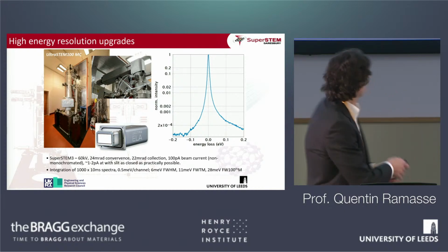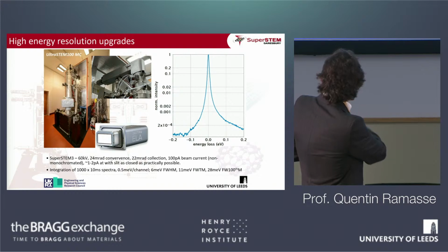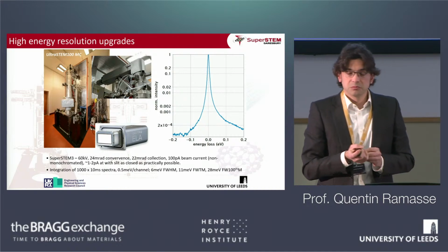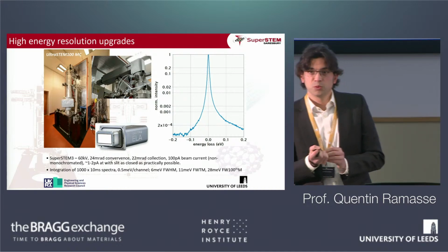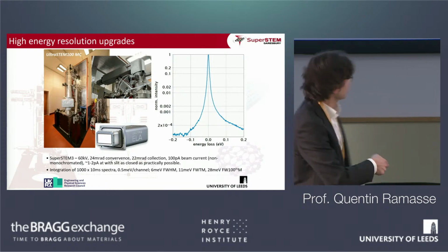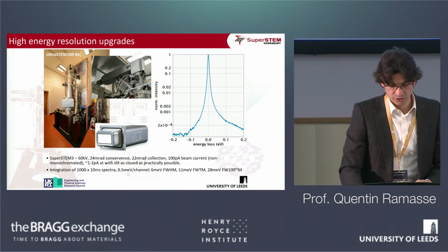So this is what was added to our machine not so very long ago. Just to give you an impression of the size of the microscope, this is about 2.5 meters tall, maybe 3 meters tall, so big, but certainly smaller than a synchrotron, more sort of human size. And you do need a ladder to get all the way up top to put those cameras up.